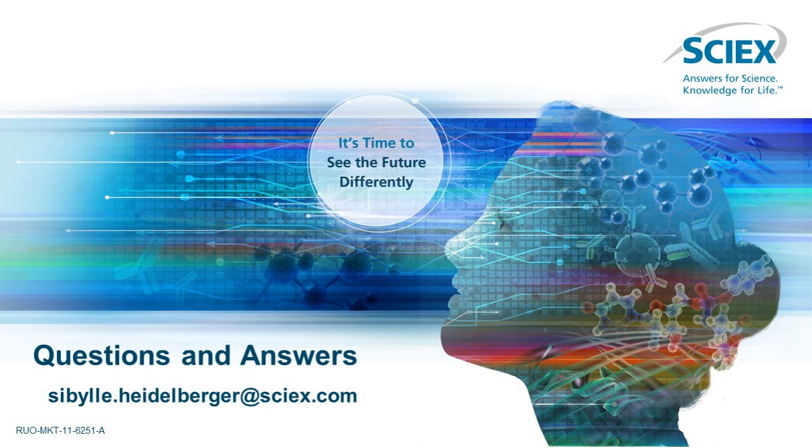So you could set up a method just to screen for those attributes that you need to monitor throughout the LCMS run. So rather than using some of the other methodologies that are currently being used, where you may have specific methods, this would actually encompass using the mass spec for one method to screen for all of the attributes that you may need to monitor.